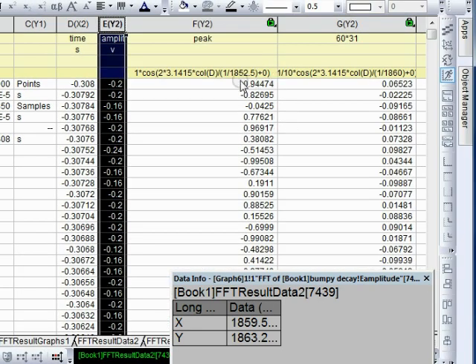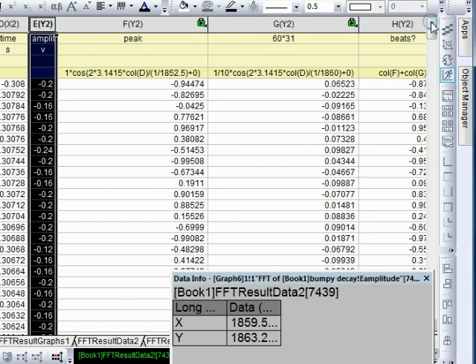So now in the same worksheet, I've created two sine functions, or cosine functions really, where it's taking the time column, and I just scaled it to 1. I could have done a scaling factor based on the number of points taken and the number of sine waves fit, but I'm just scaling that to 1. Here's my formula: cosine of 2 pi times column D, divided by my period, which is just the inverse of the frequency. Same thing over here, and this time I'm going to do 1/10 of that, because it's twice the sampling rate, and I'm just normalizing it to there.